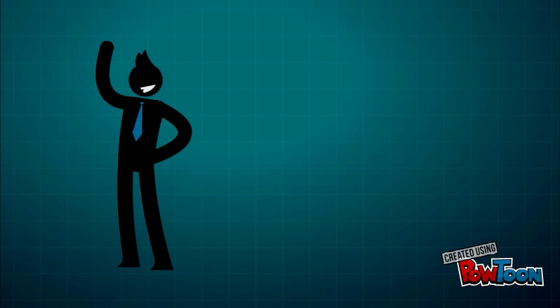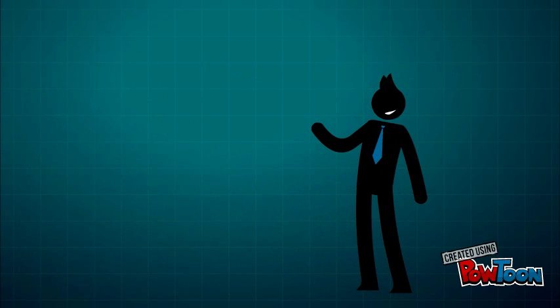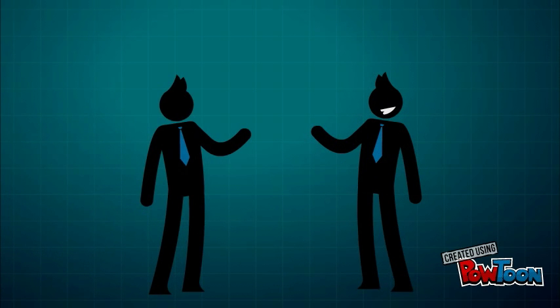And today we are going to talk about fractional distillation. You may be wondering, what is fractional distillation? Oh, great and powerful Harrison, please tell us about it. Fractional distillation is used to get a high concentration of a certain liquid in a solution of preferably two compounds using heat.